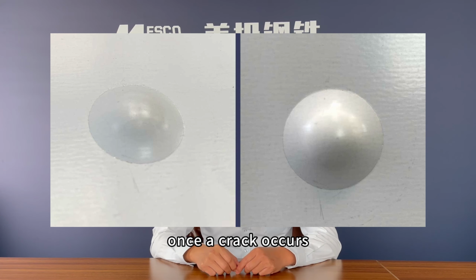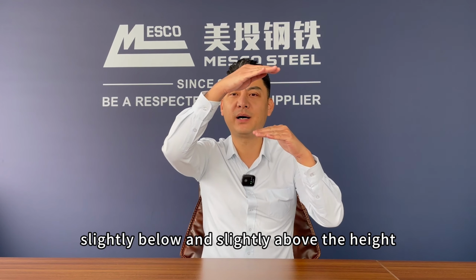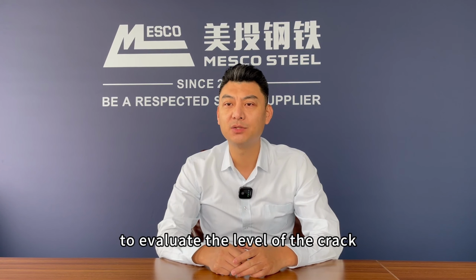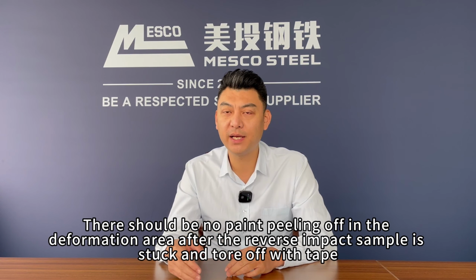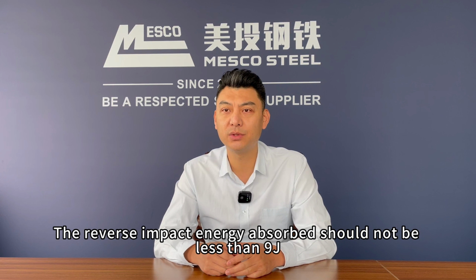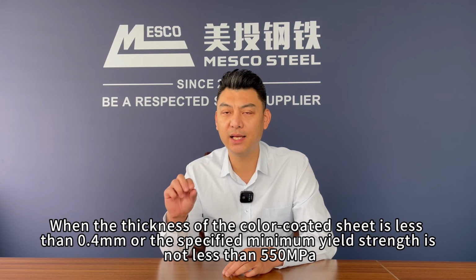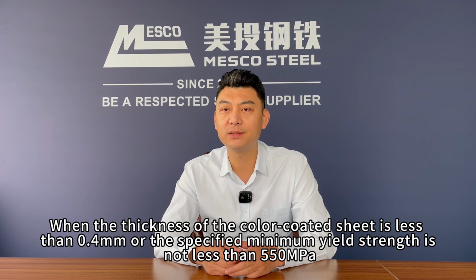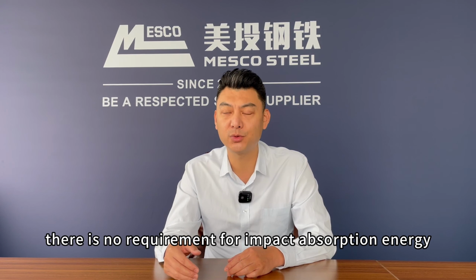Once a crack occurs, perform 3 impact tests at the height, slightly below, and slightly above the height, 5 times each, to evaluate the level of the crack. There should be no paint peeling off in the deformation area after the reverse impact sample is stuck and torn off with tape. The reverse impact energy absorbed should not be less than 9 joules. When the thickness of the color-coated sheet is less than 0.4 mm or the specified minimum yield strength is not less than 550 MPa, there is no requirement for impact absorption energy.